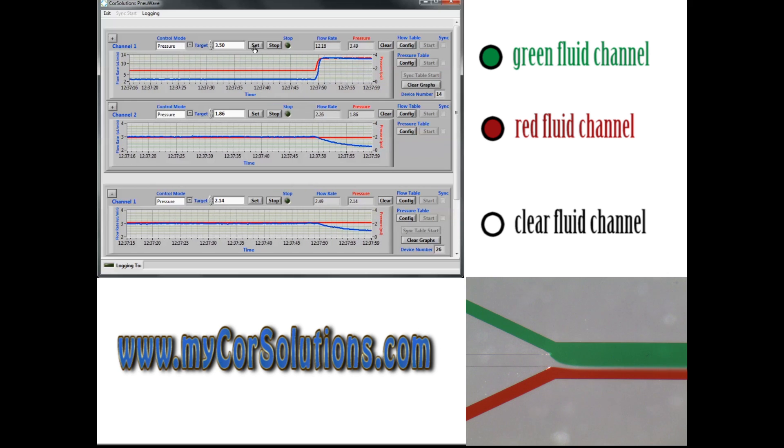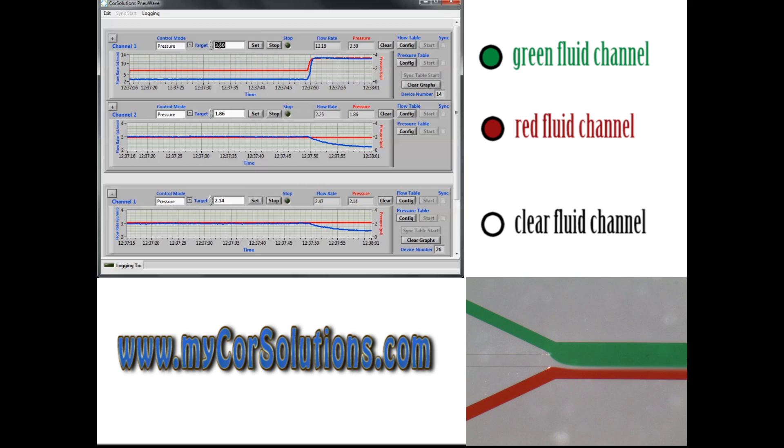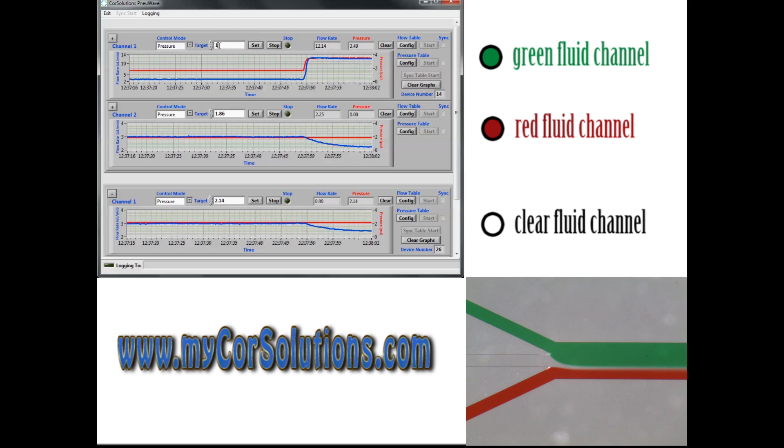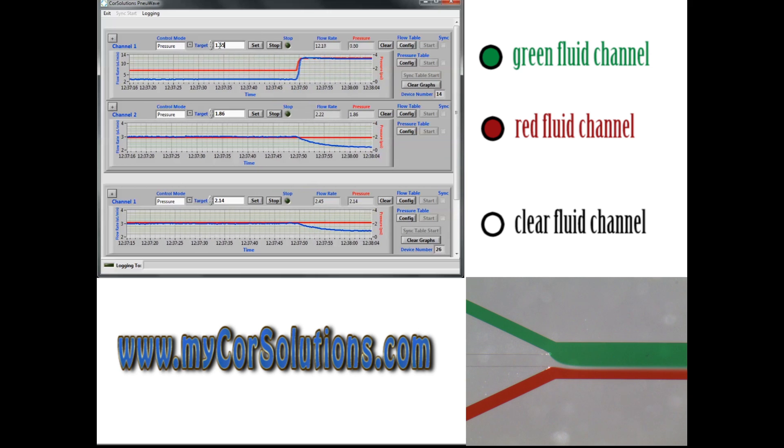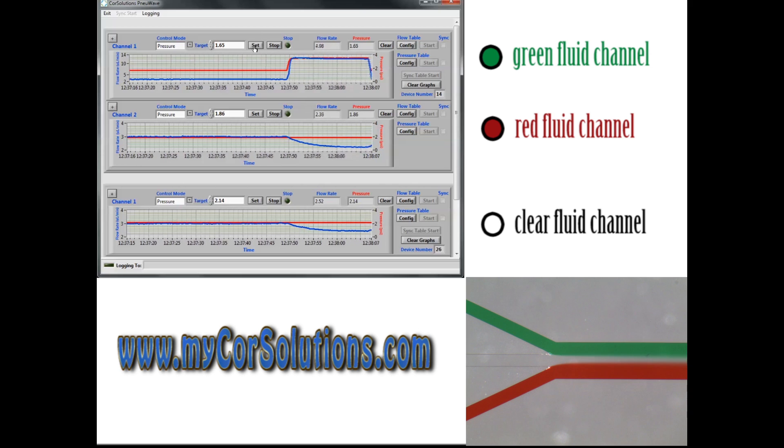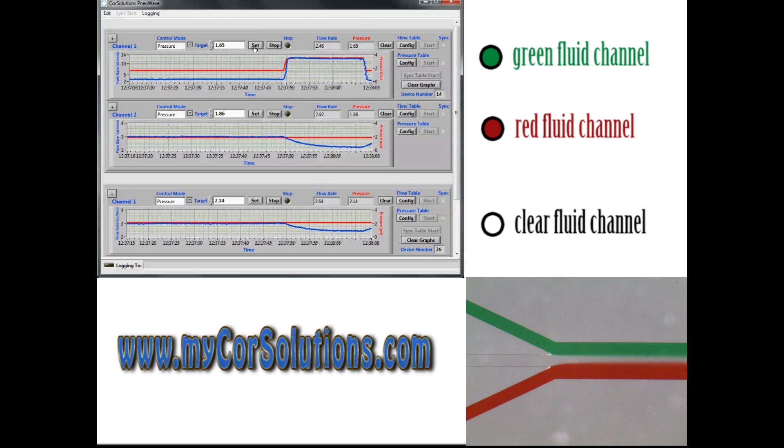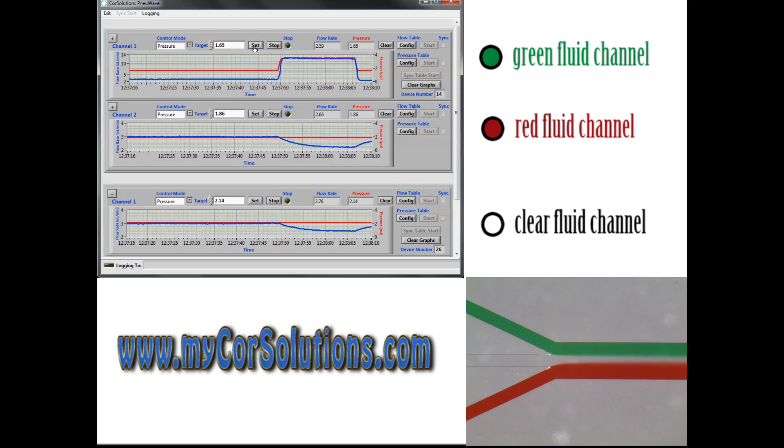In this example, three fluid streams are being delivered simultaneously using a Core Solutions new wave pump. To start, each fluid stream is switched from flow control mode into pressure control mode.